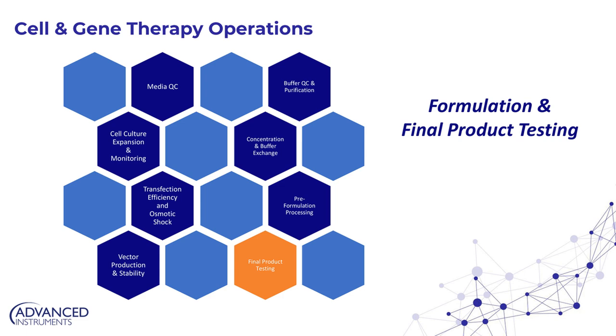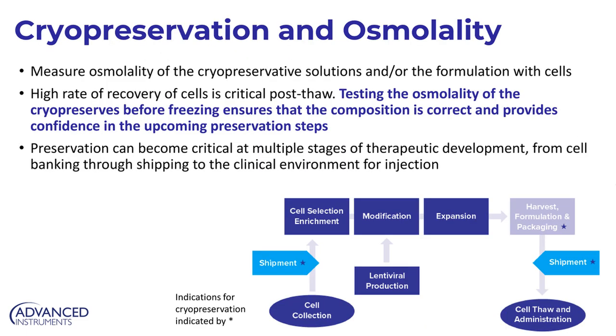So what I want to focus on is actually cryopreservation and the role that osmolality testing could and should play in these processes. So cryopreservation is obviously meant to preserve the integrity of drug substances and really ultimately to preserve the critical quality attributes of the therapies that are in process.